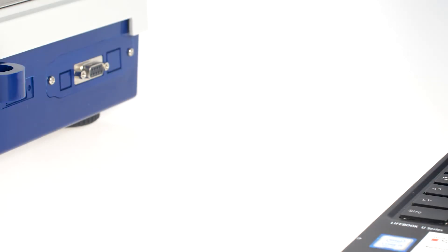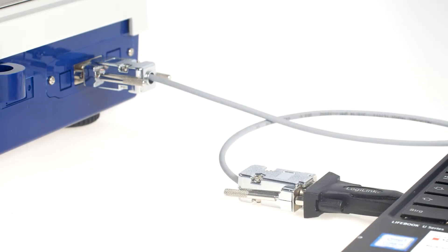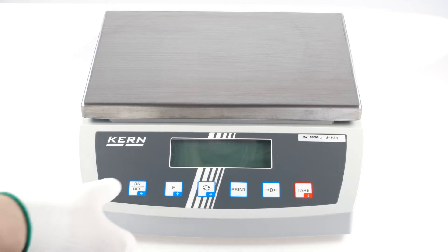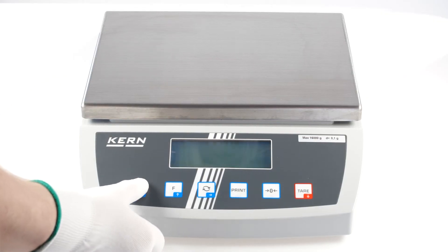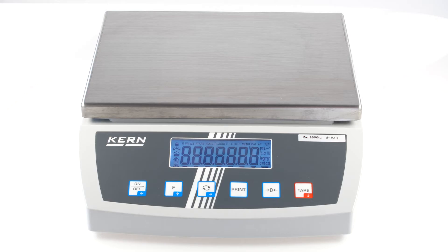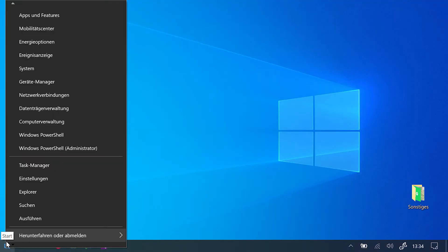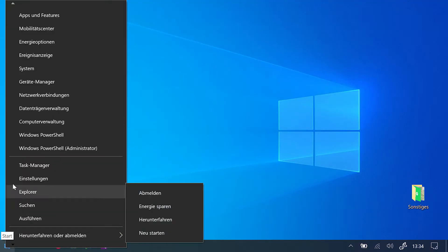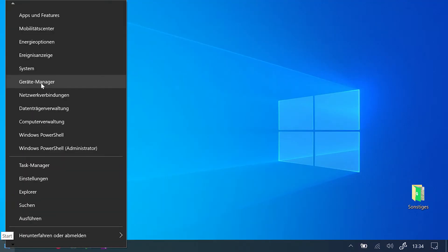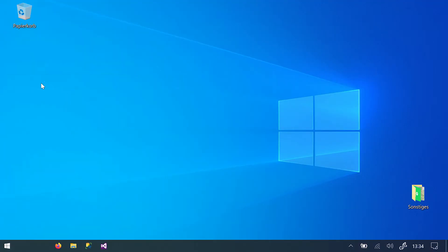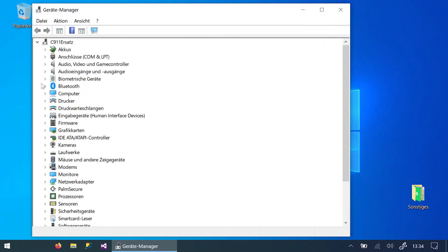The first step is to connect the balance to the computer using an interface cable. After that, the scale can be switched on by pressing the button. You can check in the device manager whether the scale is correctly connected to the computer.